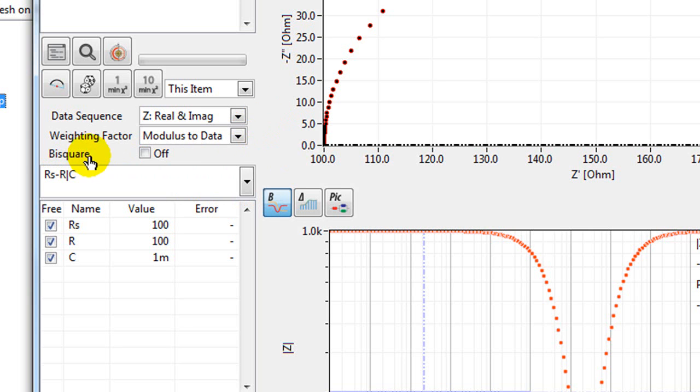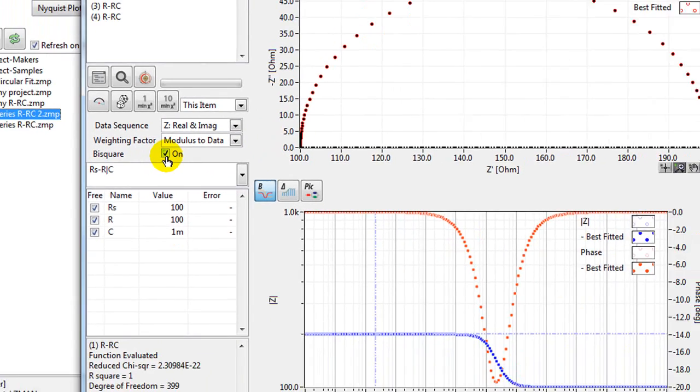You can also select the bisquare function. This will give you more accurate data but will take longer.